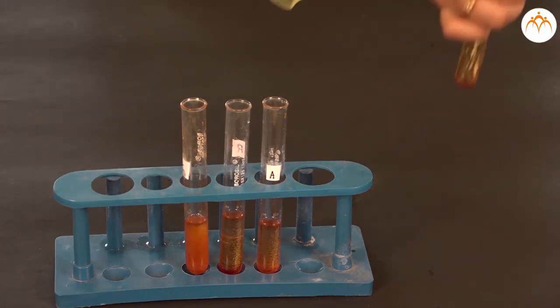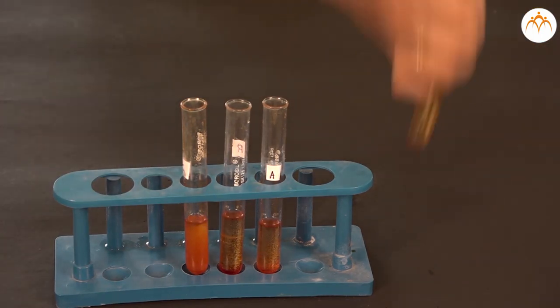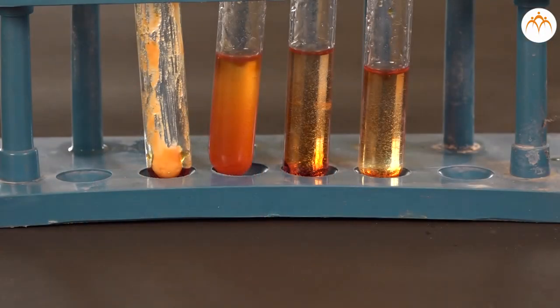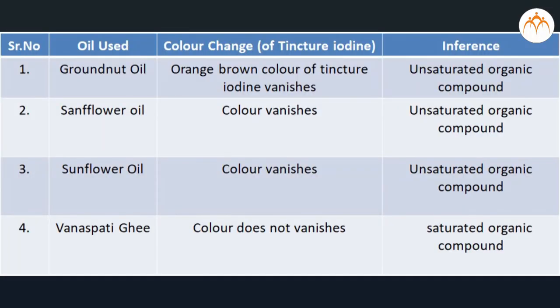The iodine test indicates the presence of multiple bonds in vegetable oils. In groundnut oil, safflower oil, and sunflower oil, the color vanishes. But in vanaspati ghee it remains as it is and the color does not change.